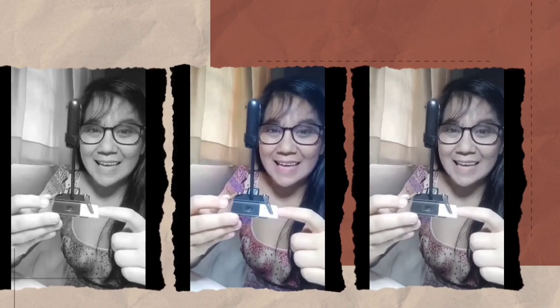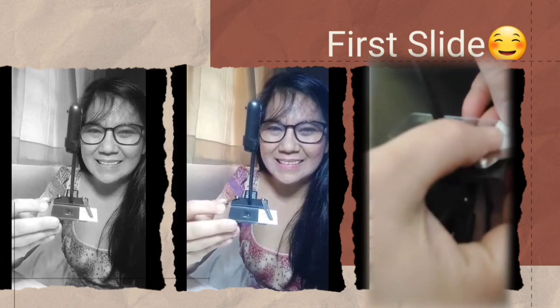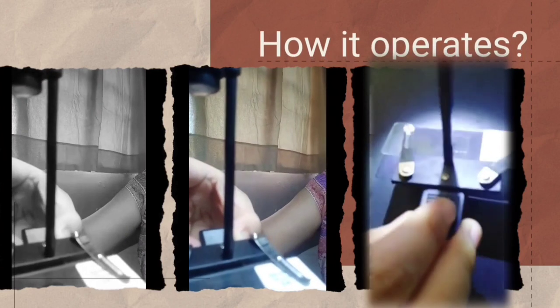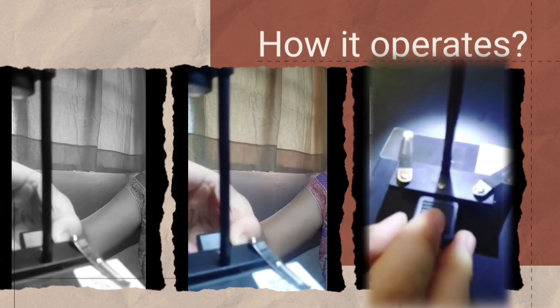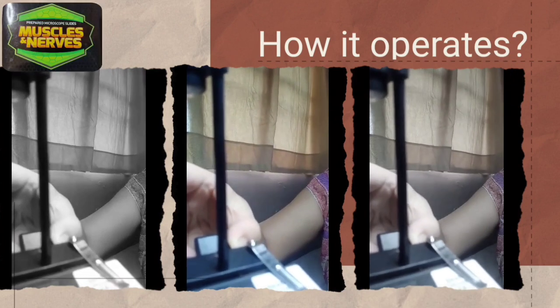Putting in the slide, the skeletal muscle slide. And I'm going to attach this to my cell phone. Galing, no? And it will just project using my cam app. It will just project on the screen.